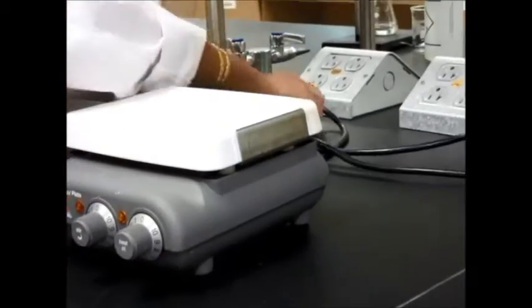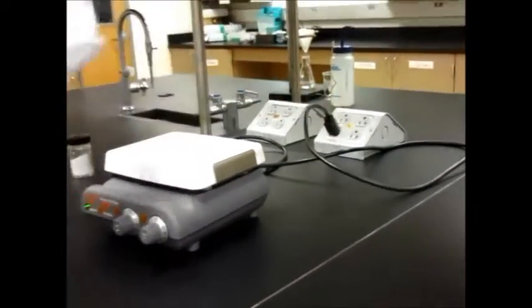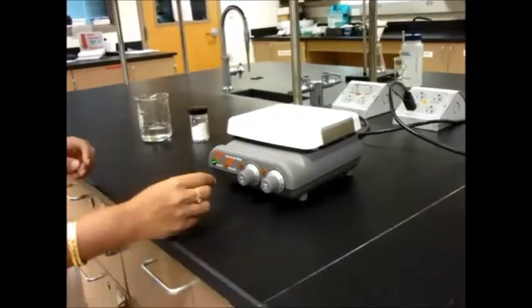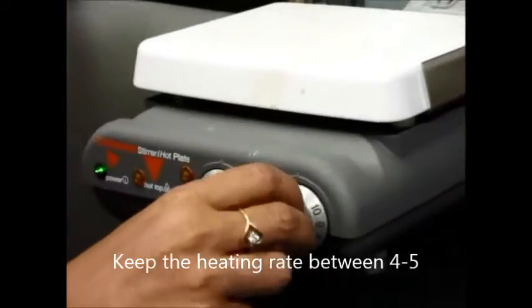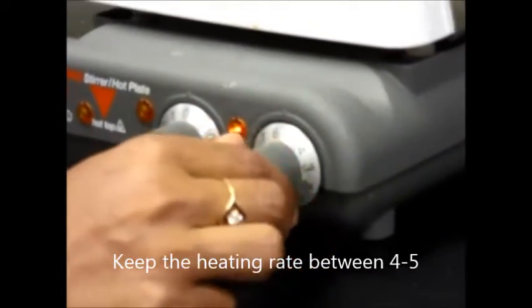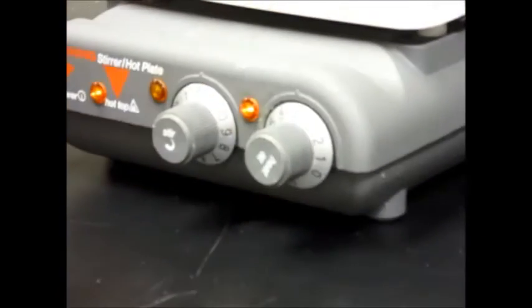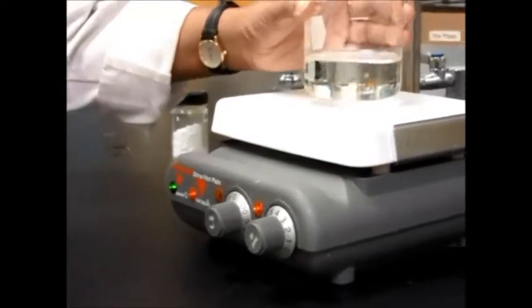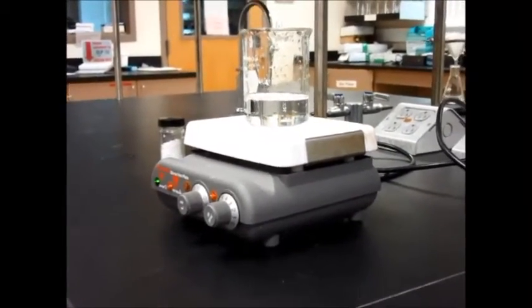So what you do is get your hot plate and plug it in. Hopefully the light will come on, and then you can start heating. The hot plate goes from 0 to about 10 — 10 is the highest. Usually you will keep it between 4 and 5 in order to boil water, for example. If you need it a little bit higher, that's fine. Each hot plate has its own heating rate. Then you can go ahead and place whatever you want to evaporate or heat on the hot plate.